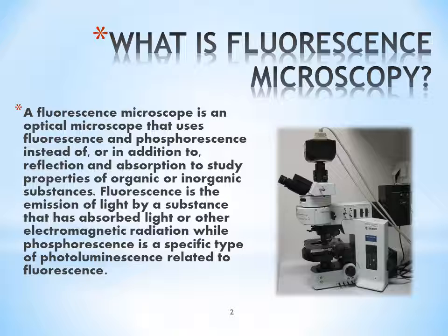In a fluorescent microscope, the specimen itself acts as a light source. The specimens used to study are either fluorescent material or stained with fluorescent dyes. A chemical is said to be fluorescent if it absorbs light at one wavelength and emits light at a specific and longer wavelength. Most fluorescent dyes emit visible light, but some emit infrared light. Fluorochromes exhibit distinct excitation and emission spectra that depend upon their atomic structure and electron resonance properties. Two fluorescent dyes commonly used are fluorescein, which emits an intense green fluorescence when excited with blue light, and rhodamine, which emits a deep red fluorescence when excited with green-yellow light.